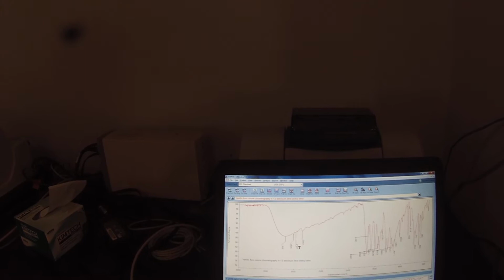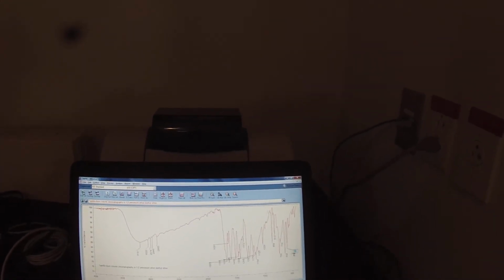I'm going to go ahead and label a couple more peaks in here because there's your SP2 CH stretch that you would expect to see. This is the aldehyde CH stretch, that one at 2860. And then these peaks here at 3020, that's your SP2 CH stretch, and these 2946 and 2876, that's your SP3 CH stretch. And down in here now, we got some fairly strong peaks.